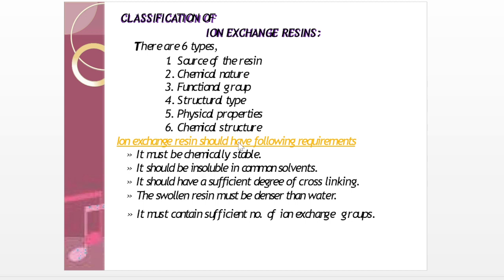Ion exchange resin should have the following requirements. It must be chemically stable. It should be insoluble in common solvents. It should have a sufficient degree of cross-linking. The swollen resin must be denser than water, and it must contain a sufficient number of ion exchange groups.